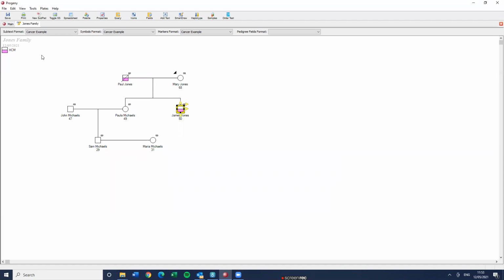It's only available in the PC client. So if you are doing these kind of power moves, the PC client is still the place to do this.